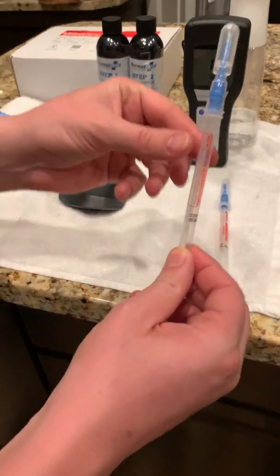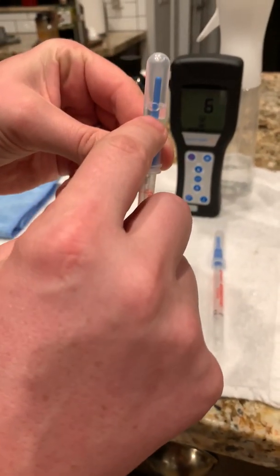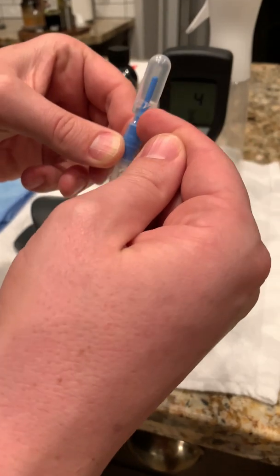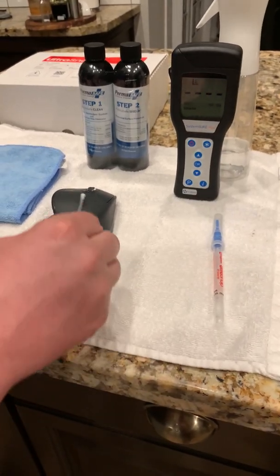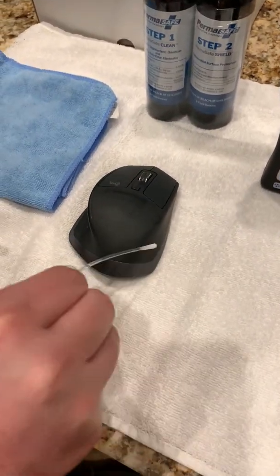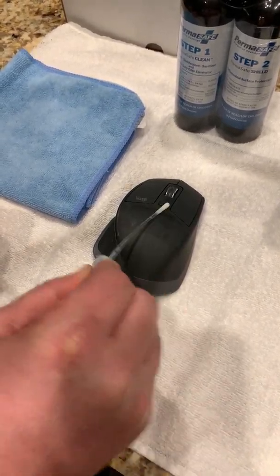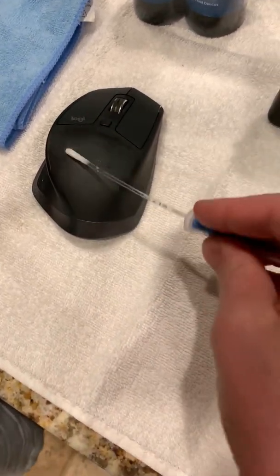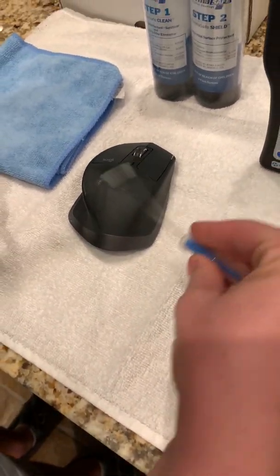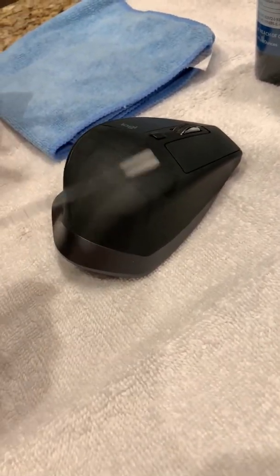I'm going to go ahead and take one of the new swabs. You can tell it's new because the liquid is still on the top of the reservoir and that blue tab is not broken. I'm going to go ahead and pull this swab out and I'm going to do a crosshatch on this computer mouse — so back and forth and up and down. I'm also twisting the swab in my hand as I'm taking that test.